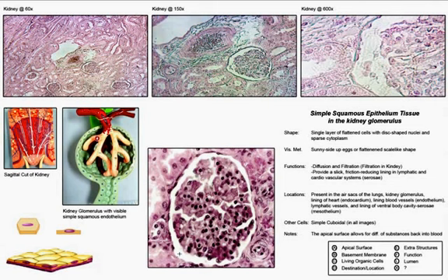This is the cup that receives the filtrate, and then diffusion would occur across the simple squamous membrane into the interstitial or extracellular matrix that's in between kidney tubules like we would see right here. This is that structure also. Here's the tubule.